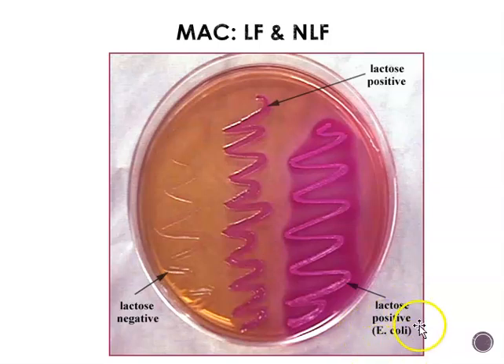And then E. coli is kind of our little different guy here. He, well, I'll show you on the EMB in a minute. He just produces a different reaction. It's still a gram-negative rod. It's still a lactose fermenter, but he really changes the media around him also.